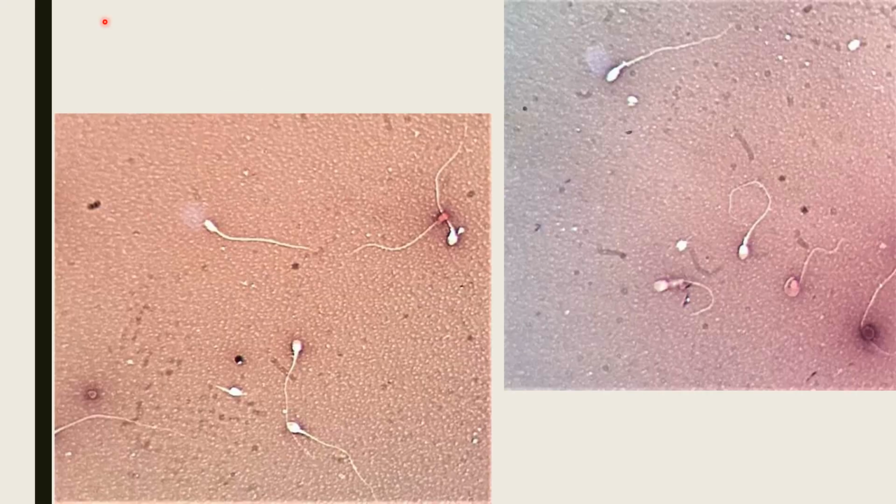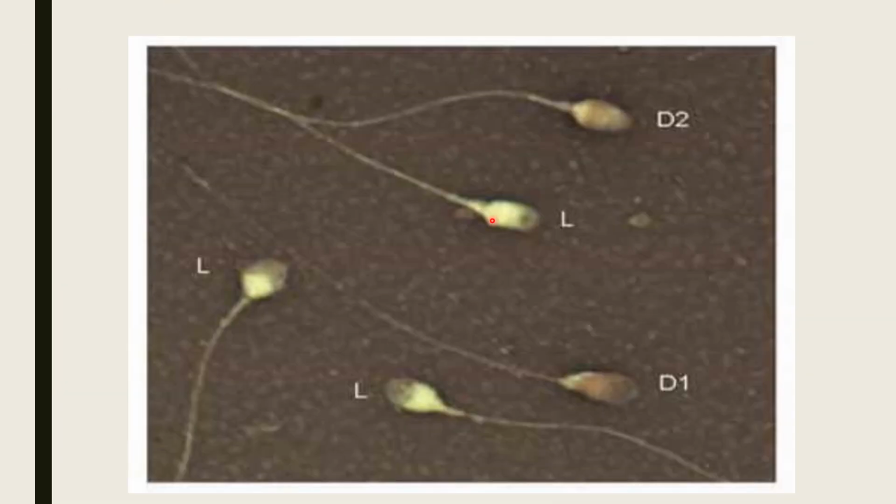So here we can see these types of cells. For example, these are non-stained cells, so these two cells are alive cells. Here we can see these cells, they are dead cells. Here in this slide we can see the alive cells, they are white in color, and pinkish color is given to the dead cell. It means stain has entered into these membranes. Here in this slide we can see these cells that are white in color. They are non-stained, they are living cells, and the stained ones are dead cells because eosin has entered into these cells.